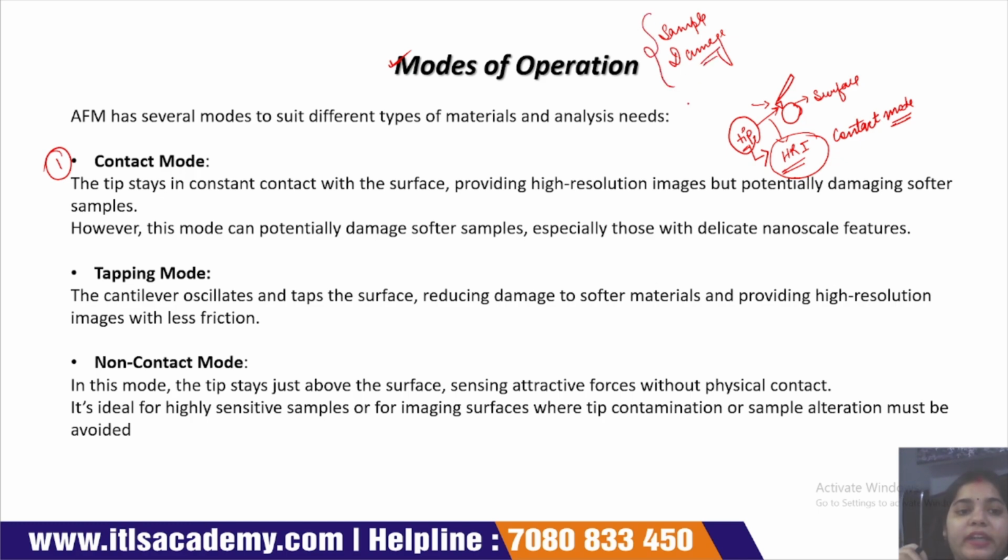In this contact working mode, softer biological samples are often damaged due to the continuous direct contact of the tip with the surface of the sample. That's why softer samples will be damaged in this mode.